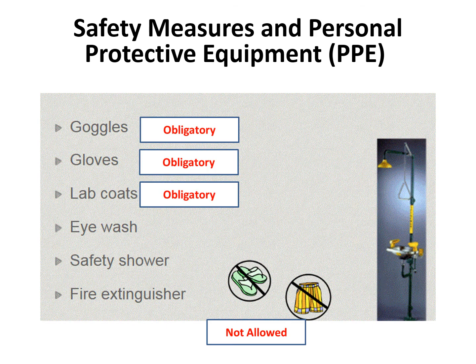Just to reiterate some safety measures and PPE issues for the lab, these are the important points. You are always, at all times while in the lab, to have approved goggles, gloves, and a lab coat on. Period. It's obligatory. It has to happen. In terms of PPE that you don't wear, every lab has eye wash stations at every sink, a safety shower at the door, and a fire extinguisher. Normally you would have a fire blanket too, but UTEP doesn't supply those, so those aren't included in our in-lab PPE.